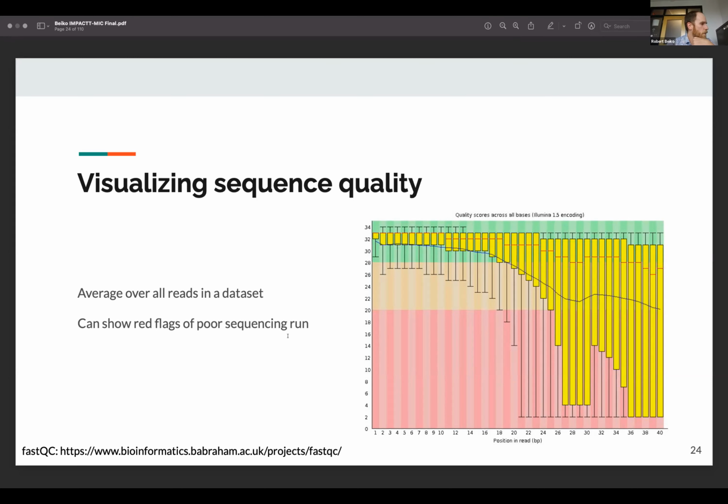You suggest R1 and R2 to overlap with each other when designing the primers to improve the quality.